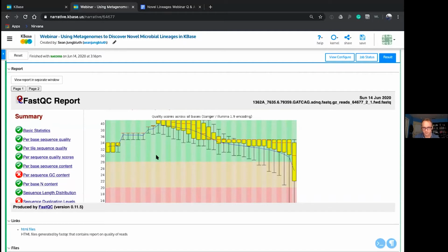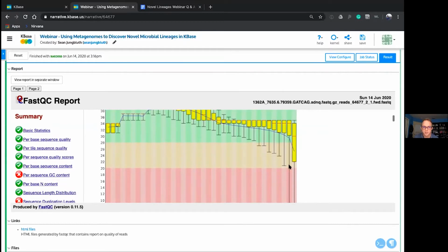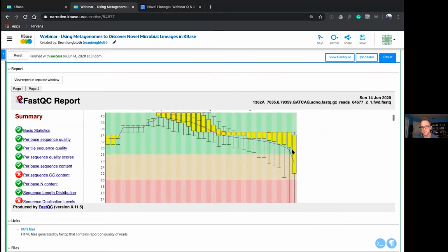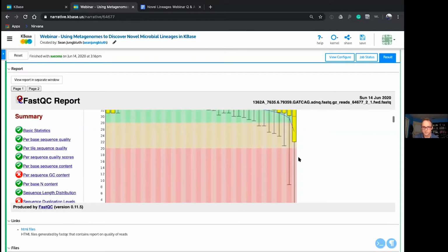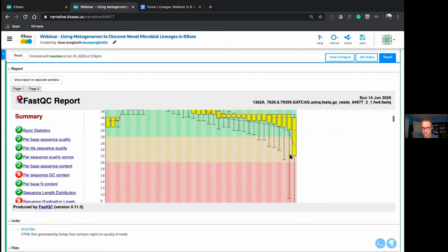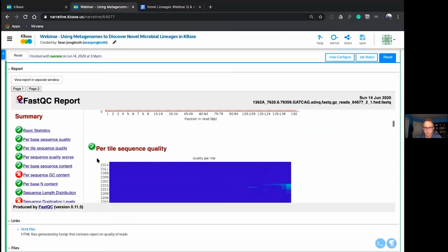And so this is a very common profile that we see in Illumina sequencing, where the quality is pretty good at first, and then it starts to tail off as we approach the end of the sequenced read. But overall, and consistent with how JGI has already QC'd these data, these are pretty good in my opinion right now. There's no data where the average points are in the red zone or the yellow zone here. So these data have already been QC'd. Important to keep in mind.